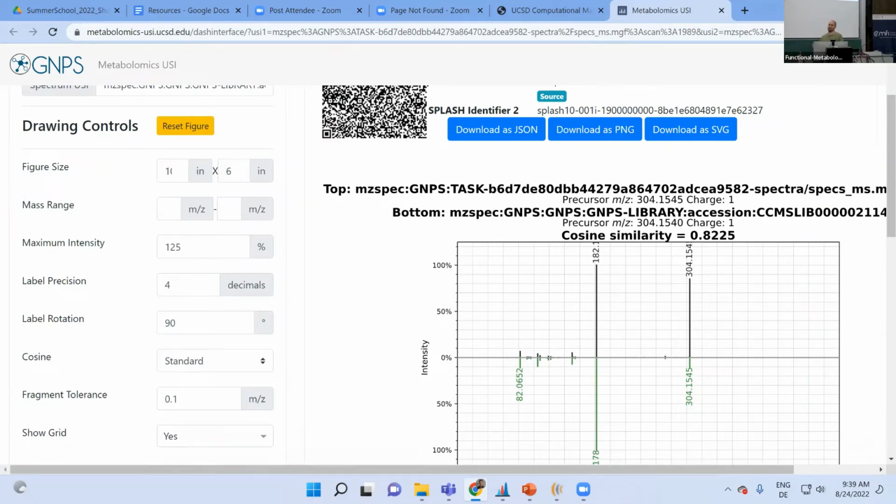So that's why they just have a shifted window in 50 MZ units and then remove all the low abundant peaks there. If I would turn this off, then I think it should show you the same value. And actually that is something that you might want to try. For me, working with very complex data where I also often have chimeric spectra, so that means spectra that result from different precursors in the same isolation window, it is not beneficial to filter too much. So I get more hits when I turn this off.